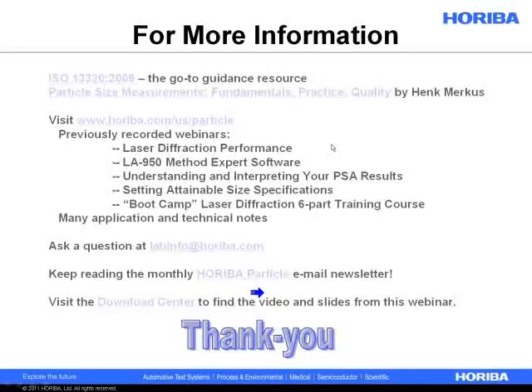Whereas the regular flow pumping systems and a lot of modern laser diffraction analyzers tend to be 100 milliliters and above, typically 200 milliliters and above, there are certain accessories like the mini flow for the LA950 that drop that volume requirement to 40 or 35 milliliters.